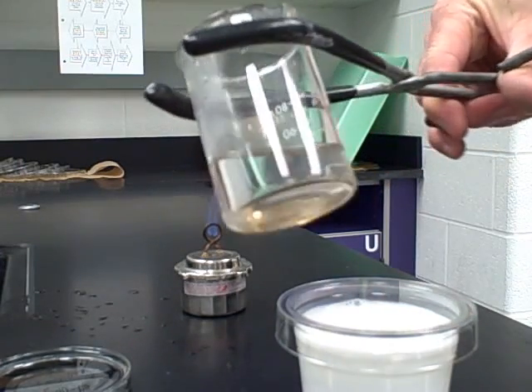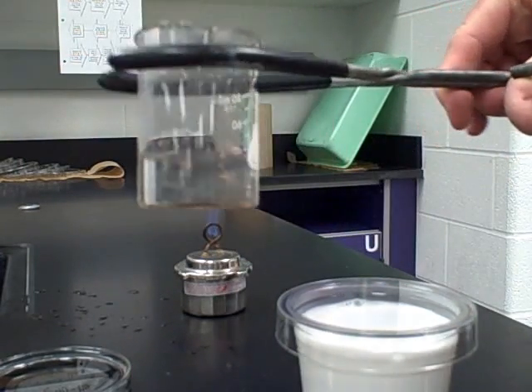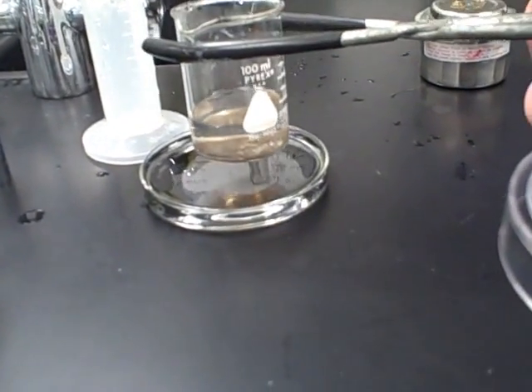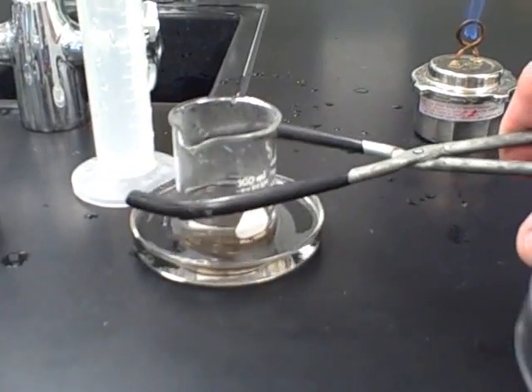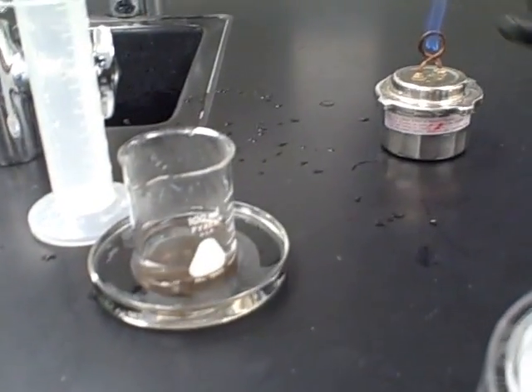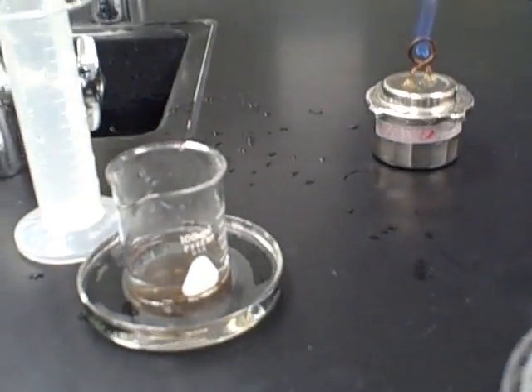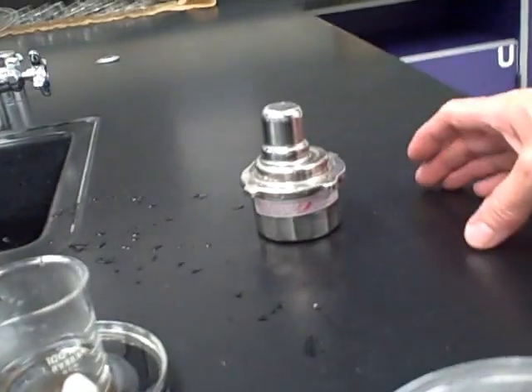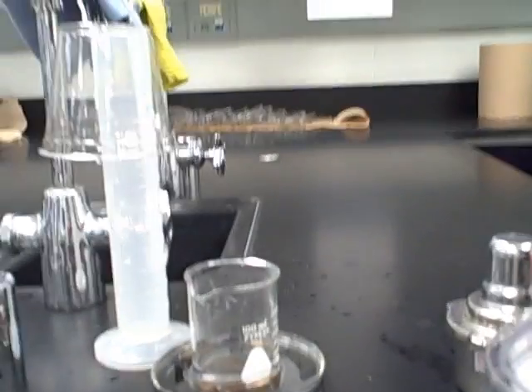Our borax solution is now dissolved. Now we put it in a water bath, which is nothing more than a glass petri dish filled with water. We place it in there and that rapidly cools the substance off — we don't want this to be hot when we go to use it. Then put the flame out.